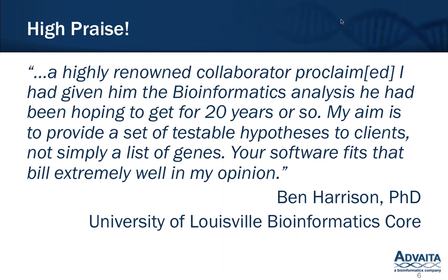Here's a quote that we recently received. "A highly renowned collaborator proclaimed I had given him the bioinformatics analysis he had been hoping to get for 20 years or so. My aim is to provide a set of testable hypotheses to clients, not simply a list of genes. Your software fits that bill extremely well, in my opinion." And we've heard this more than once from a number of bioinformatics cores, and I think this is a testament to the type of analysis that you can get with iPathwayGuide.